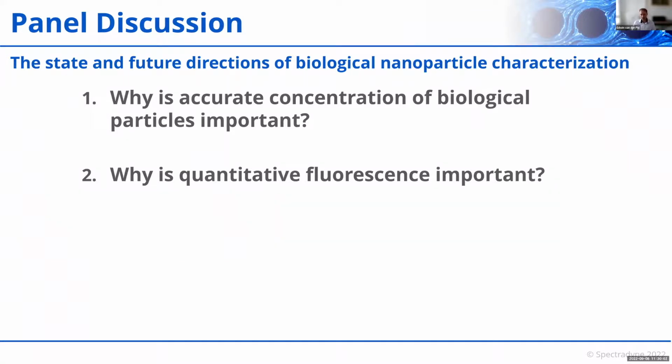Now, why quantitative? I think the answer already popped up a little bit in the previous question. Submicrometer particles in biofluids are heterogeneous, and therefore they differ in the available binding sites. So if you would make a distribution of the fluorescence intensities, you get a very broad distribution. So if you want to start comparing this information to other labs or aim for a reproducible assay, it's important that you quantitatively know the intensity range wherein you are measuring.